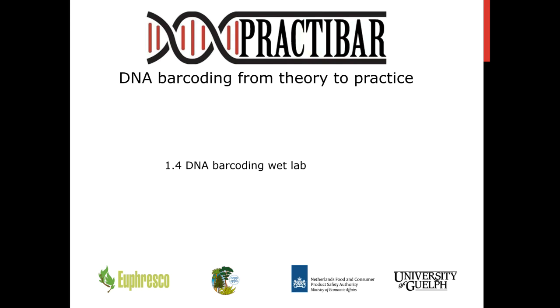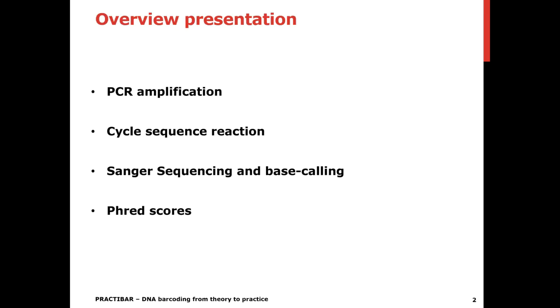It's dealing with what is happening in the lab about DNA barcoding. What are you doing in the lab and how are you doing that? So the presentation goes about PCR amplification, the cycle sequence reaction after the amplification, the Sanger sequencing and the important base calling afterwards, and a little bit about Phred scores.